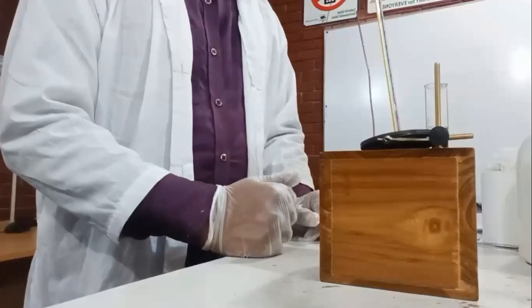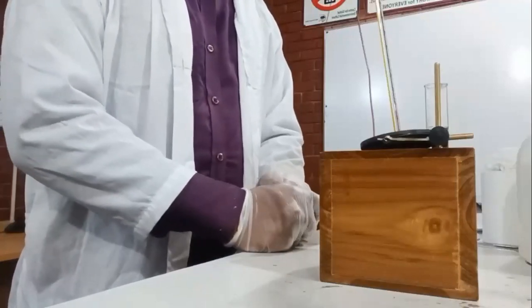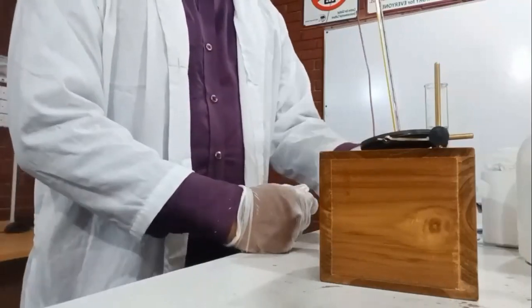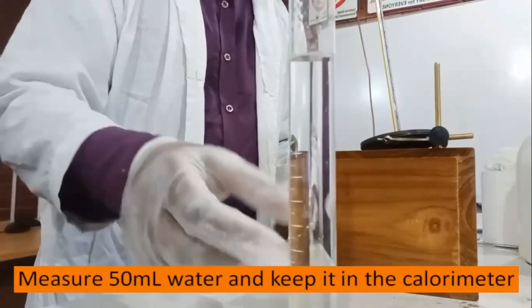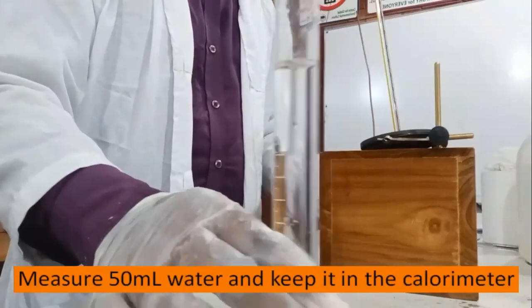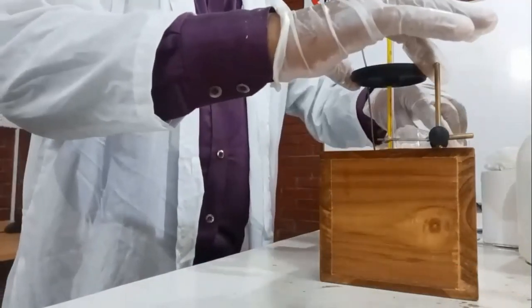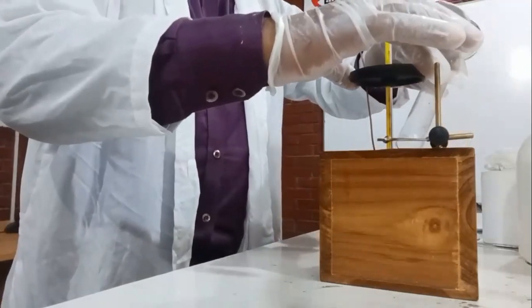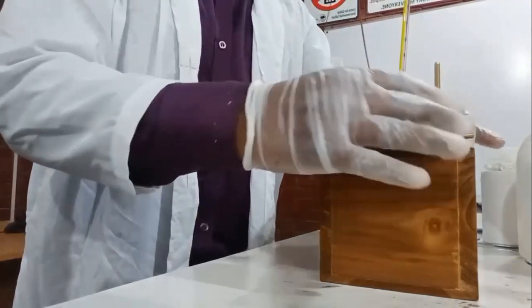Now, I will show you the procedure for how we can do the experiment. Today, we will do the exothermic process. For the exothermic process, I have to take 50 ml water. I have measured 50 ml water by measuring cylinder. Now, I will take this 50 ml water in the calorimeter. So I have taken 50 ml water in the calorimeter.